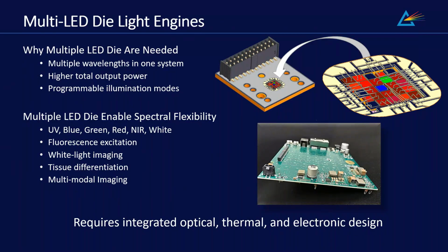platform. At the same time, integrating many emitters into a compact optical system introduces new engineering challenges involving thermal management, optical homogenization, radiance preservation, and electronic control. As a result, the performance of these systems depends heavily on how the complete illumination system is engineered.